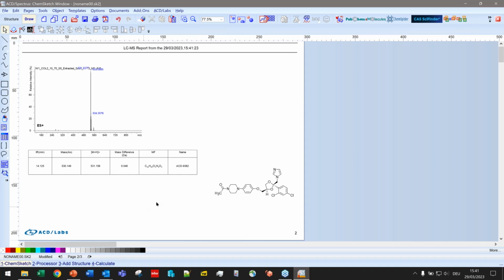information for the first component. So that's this structure here. There's my table of components with the information that I've selected. You can see the spectrum. That's my single scan mass spectrum, by the way. And some things that I'm not happy with is the description here. I want to change it to reflect that this is a single scan mass spectrum. And maybe the retention time would be great so that I know which retention time this mass spectrum refers to.